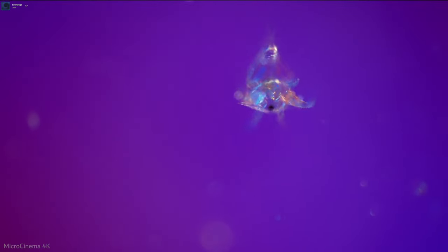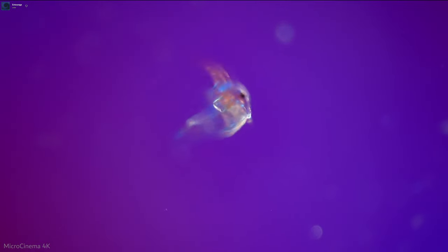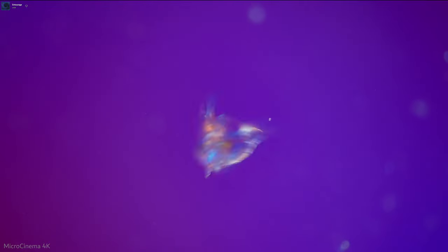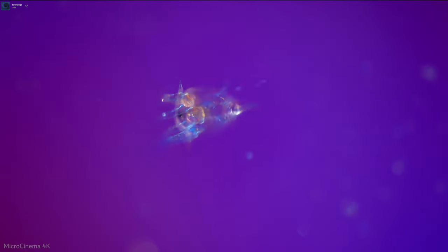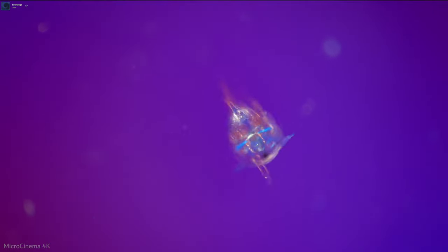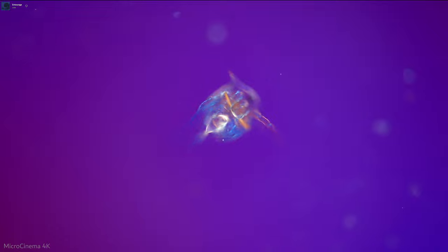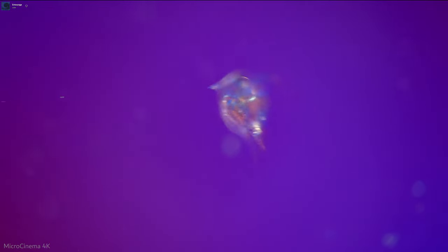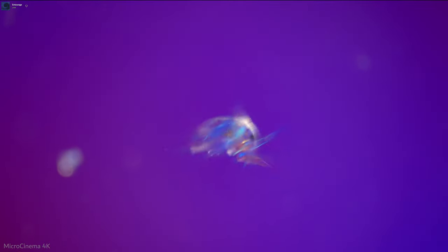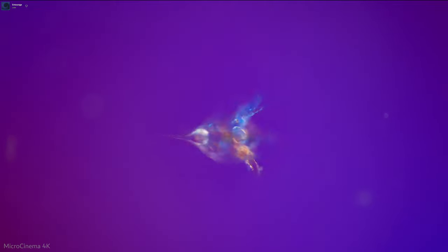And it's so cool. I love when you can see so many of these critters, like tardigrades and these little crustaceans and whatnot. Mechanically, they're very simple. In the human musculature system, we have so many different muscles and fine little muscles and whatnot. It's very complicated in big animals, but with all these little animals, a lot of times there's just one little strand connecting to each limb or something like that. Very fun.